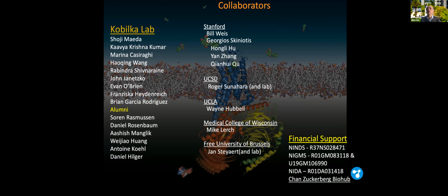There's a question from Dr. David DeRosier. The question is the inherent flexibility of the proteins. Do you think that is the limiting factor preventing it from going beyond 3 or 4 angstrom in cryo-EM structure analysis?